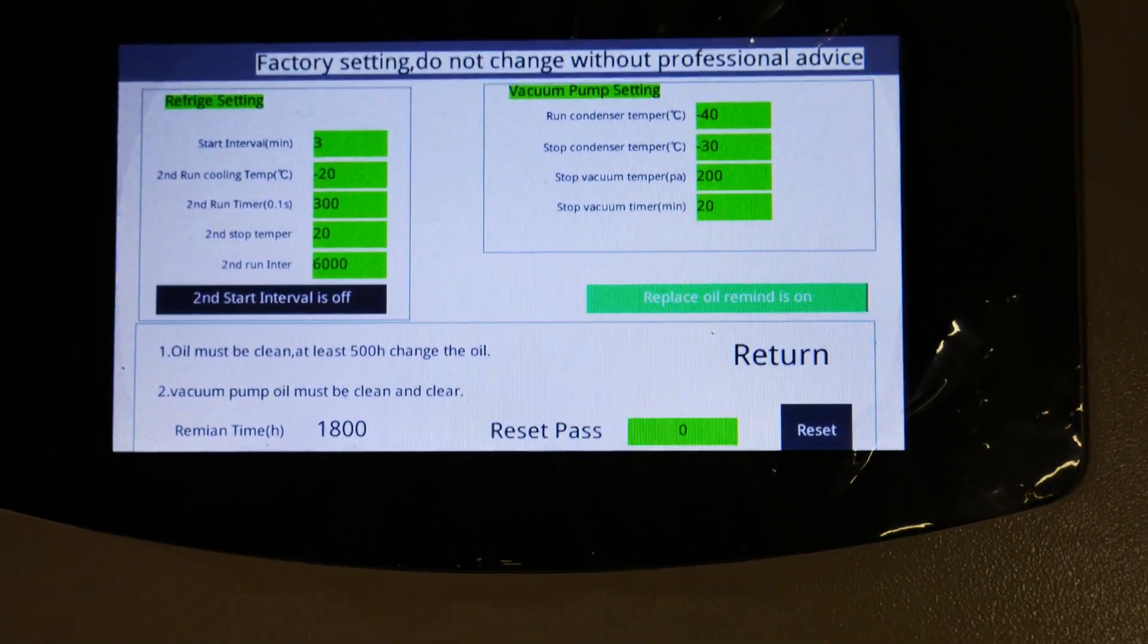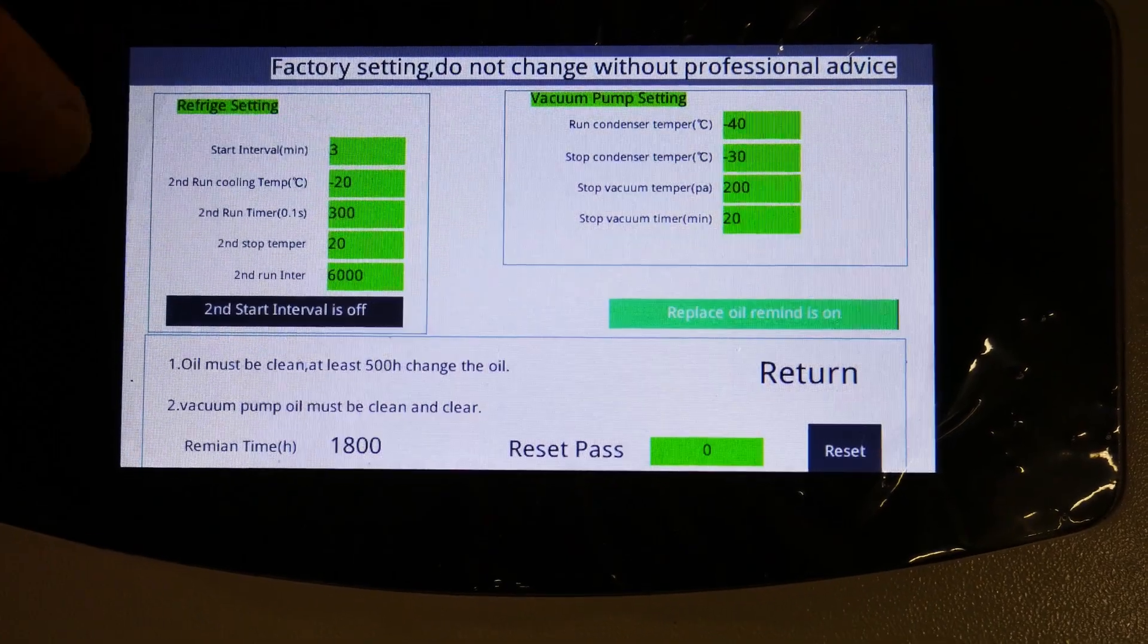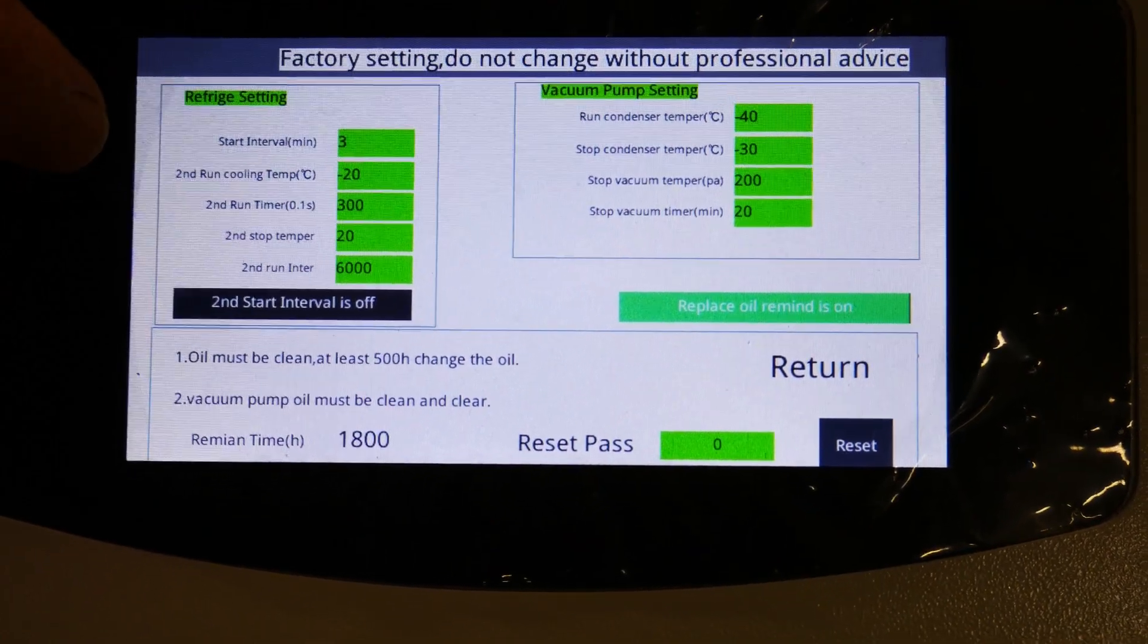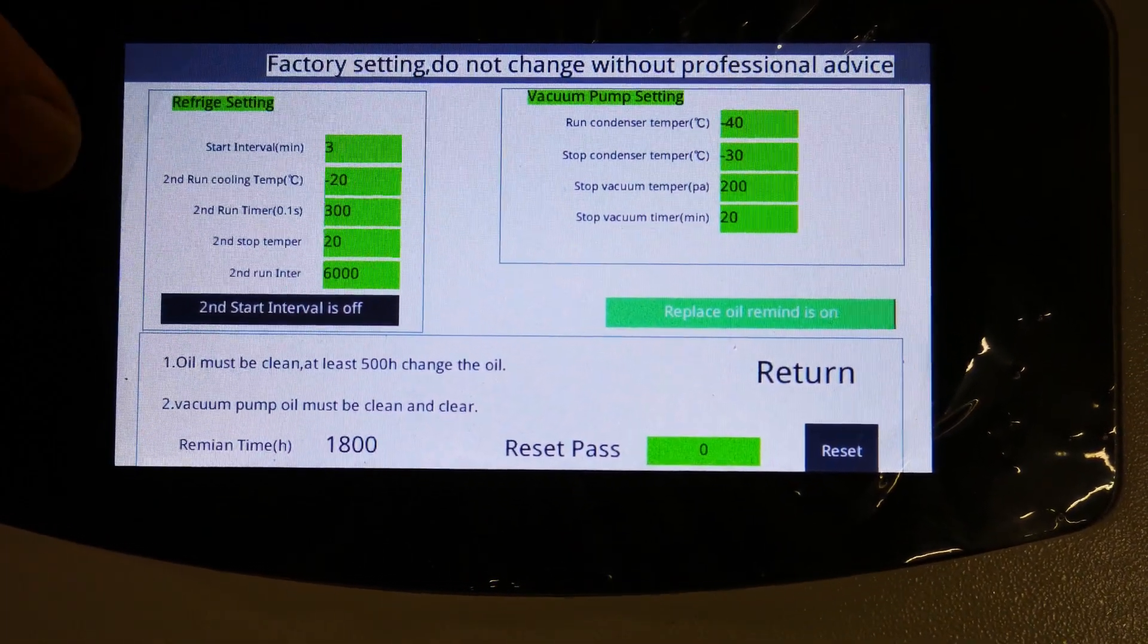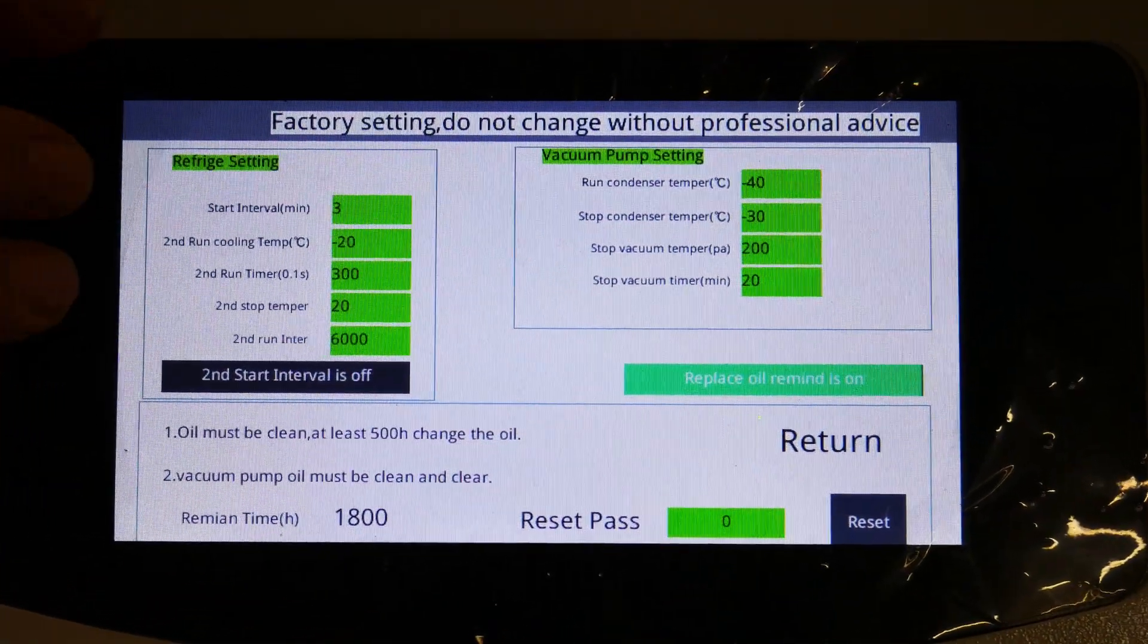The system has two compression stages. In the beginning, it cools down very quickly. In the end, you may need only one compressor to be working, so the system automatically decides which compressor should come on and which should be turned off.